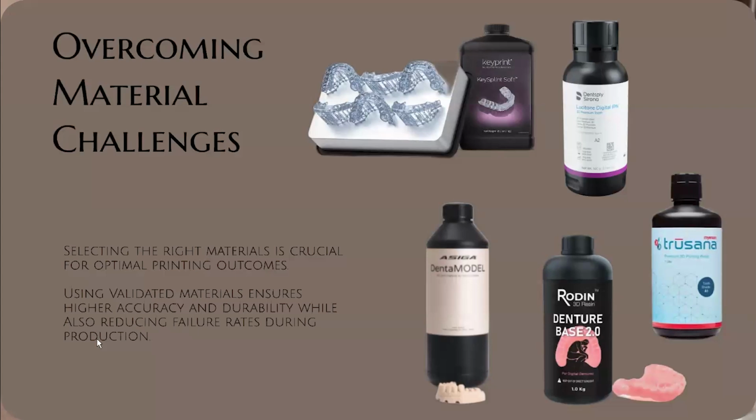So you want to make sure that your materials are validated, and that can mean multiple different things. But the key thing I want to know is, when somebody says it's validated, have you printed a number of items in this material in your printer? And do you have the results of that? Validation just means, yes, we printed this, we've tested it, the strength is still there, the accuracy is still there, and so on.